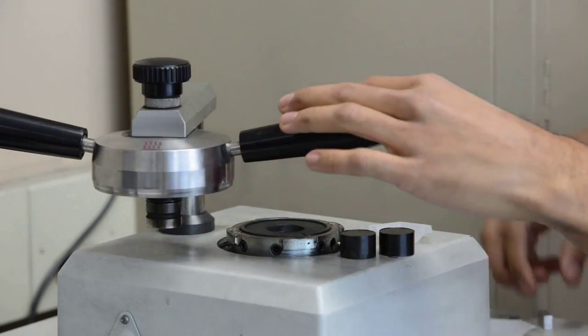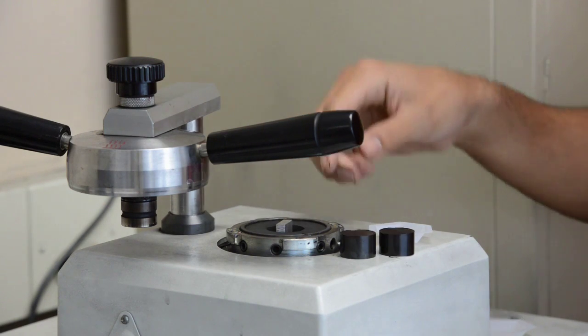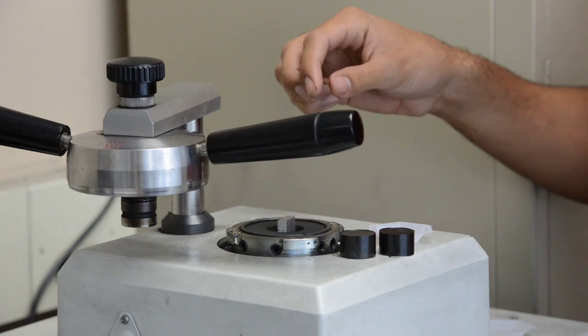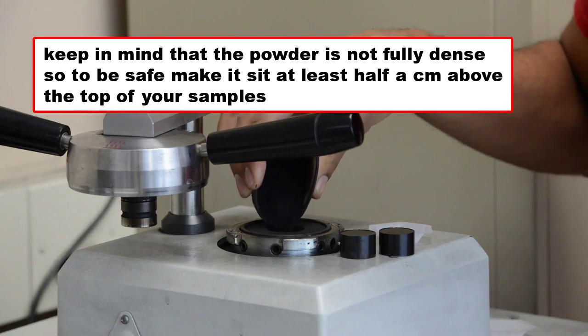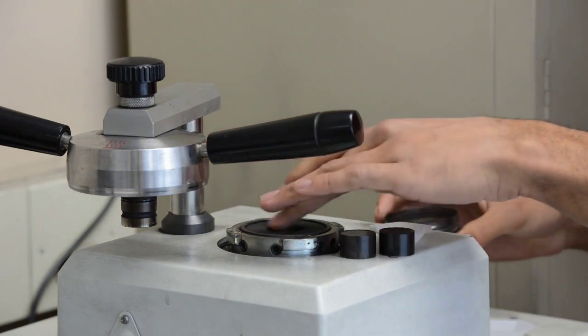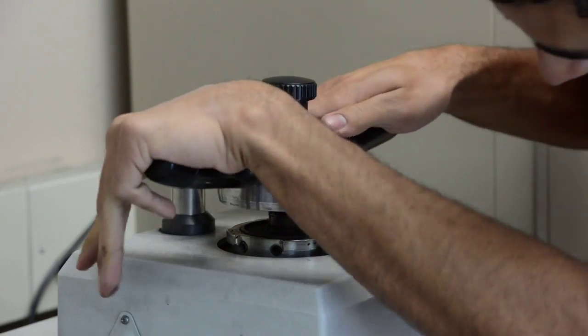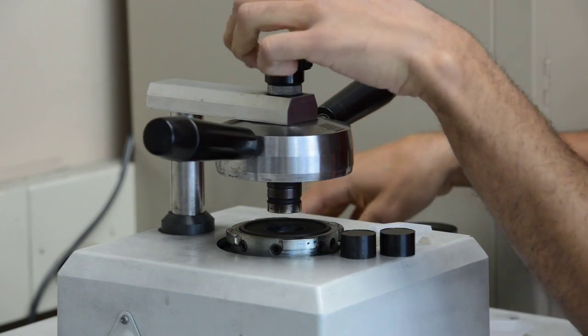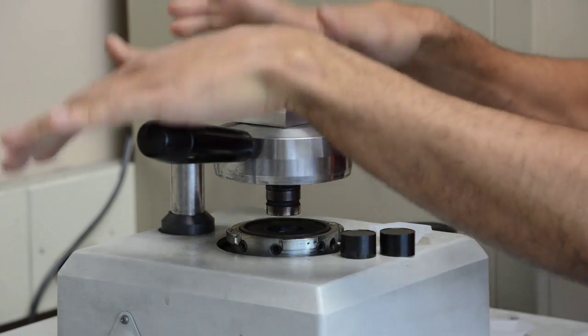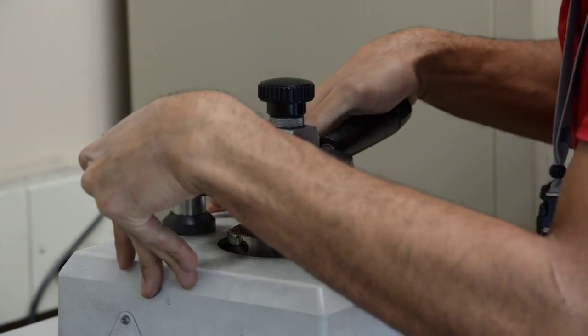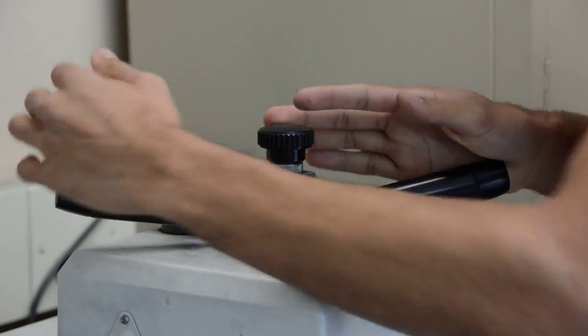So I'm just going to fill this in with conductament. This is the case where I didn't remove all of the conductament on the side. Put that in, twist it, and start the cycle again.